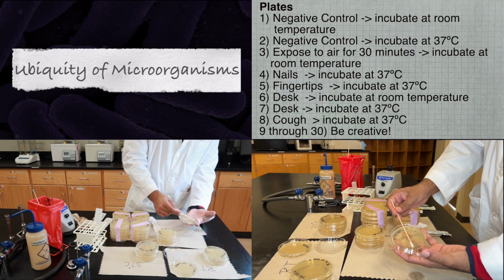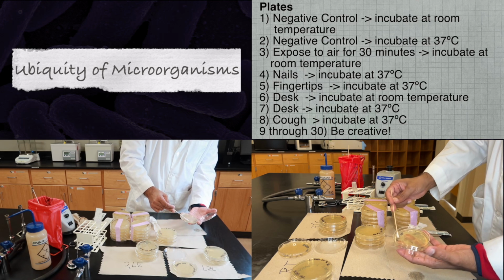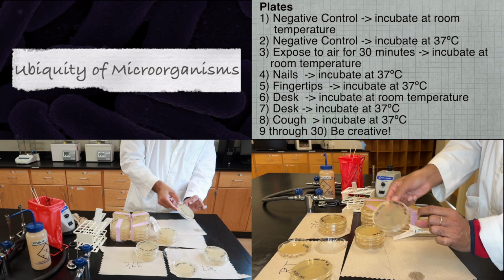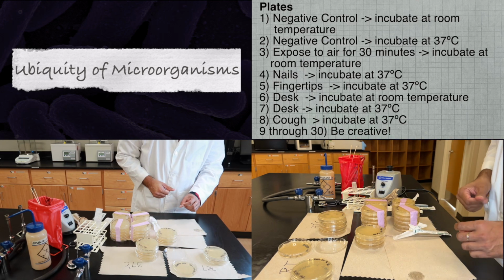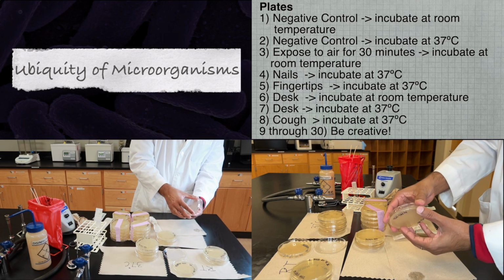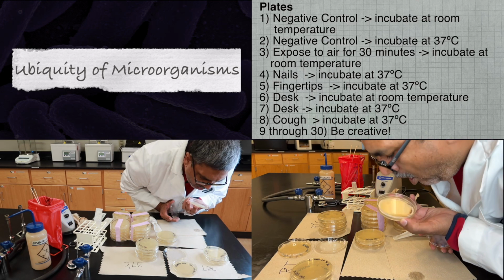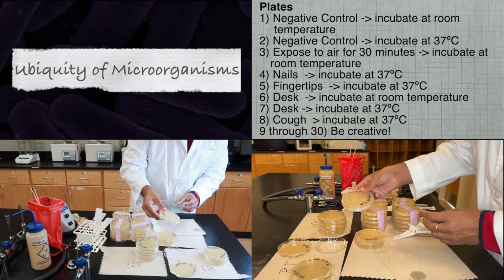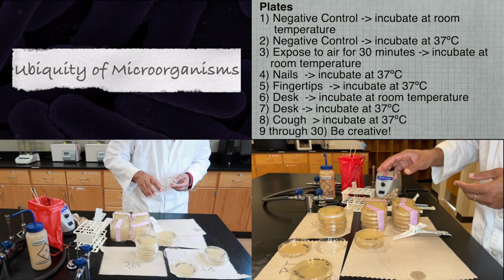And wipe the cotton swab across the agar surface. This plate number 7 will then be incubated at 37 degrees Celsius. For plate number 8, please distance yourself from other students, open up the plate, and vigorously cough multiple times onto the surface. This plate will then be incubated at 37 degrees Celsius.